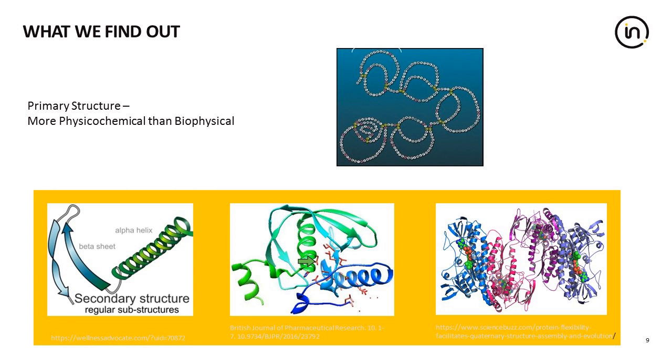And if there is more than one polypeptide chain associated with each other to form a dimer, trimer, or whatever order of oligomer there is, it's the quaternary structure of a protein. And collectively, biophysical analysis provides information about the secondary, tertiary, and quaternary structure, which are also referred to as the higher order structures of a protein.